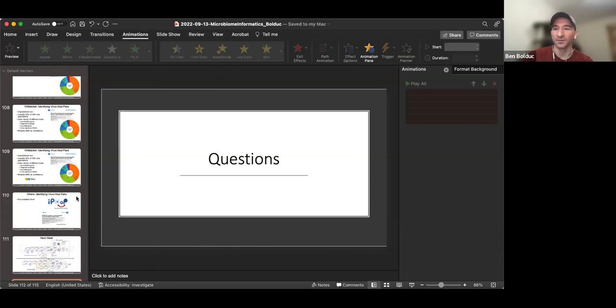A lot of individuals will take 500,000 predicted viral genomes and just submit them all without any type of quality information associated with them, without looking through and identifying what are high confidence, low confidence, no confidence.